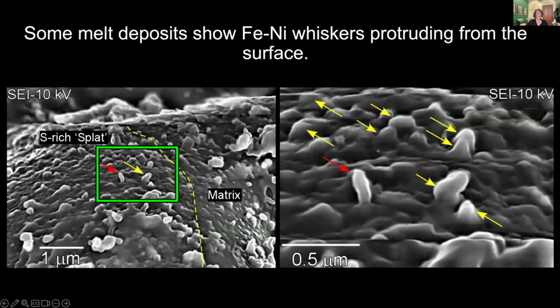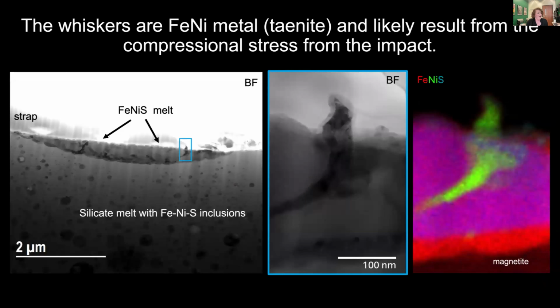Some of the melt deposits also have these whiskers that are enriched in iron or nickel that you can see in these SEM images here that are protruding or sticking out from the surface of those melt deposits. We can take cross sections and look at these features in the transmission electron microscope as well. And you can see those in the cross section here, almost like hands reaching up from the interior of these grains, telling you that they've been affected by space weathering. And looking with EDS mapping, we can tell that the composition is enriched in nickel and iron and formed from likely iron-nickel metal.